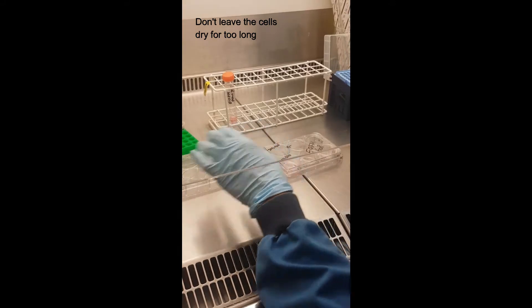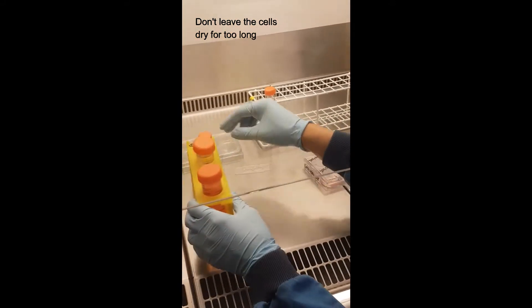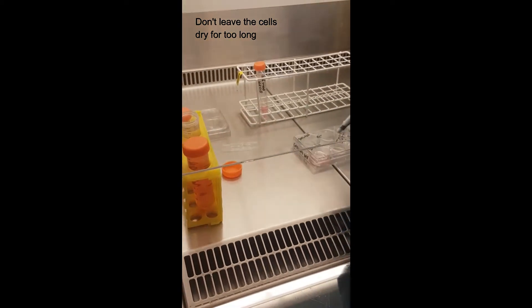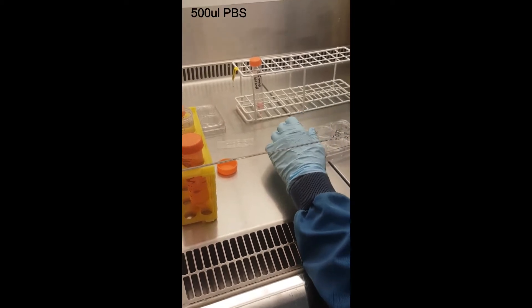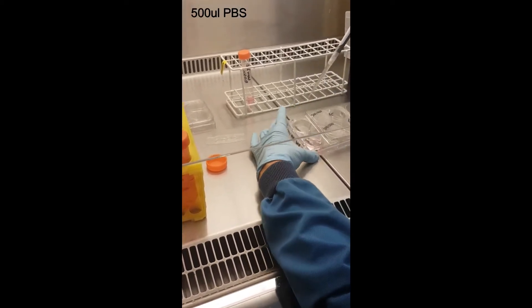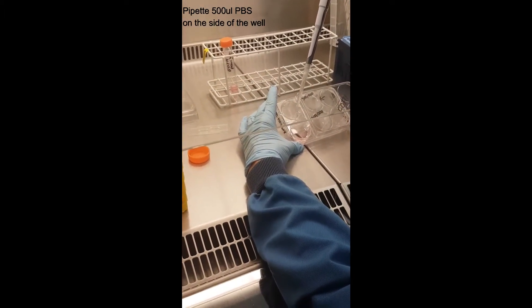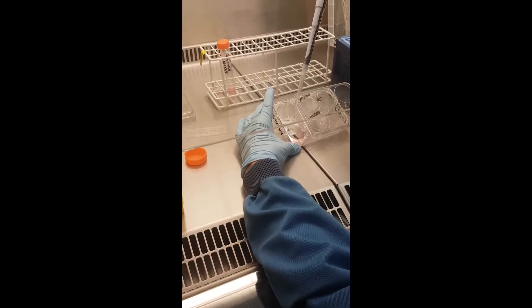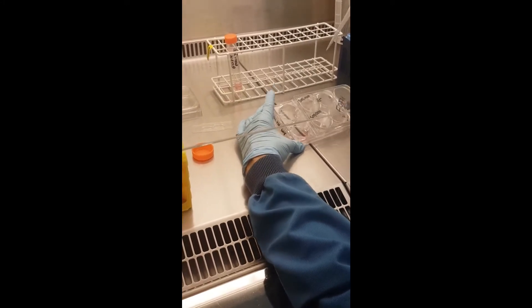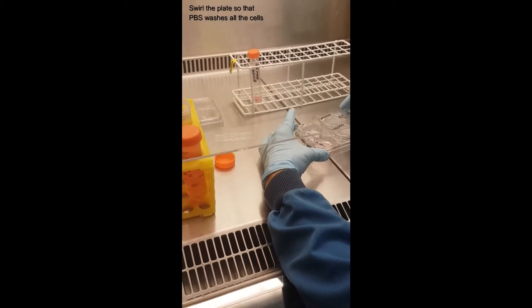In all steps, don't wait too long — cells don't like to be without liquid and will dry out and die. PBS is added to wash, but we want to prevent washing off cells. At this stage, pipette at the wall side carefully — but not too forcefully — you want a balance so the liquid is not cutting off the cells. Just roll around a bit.